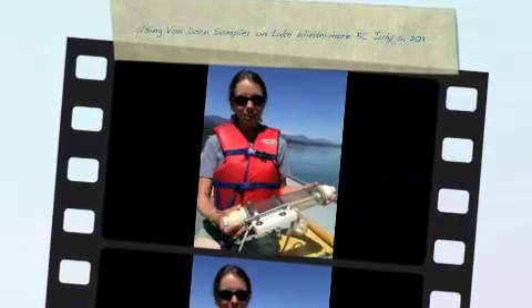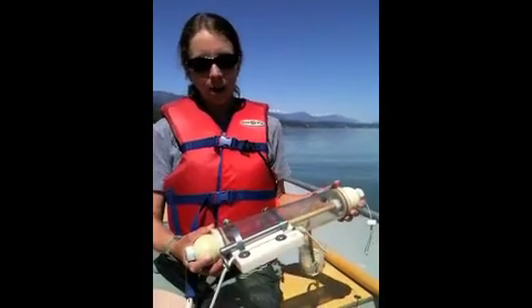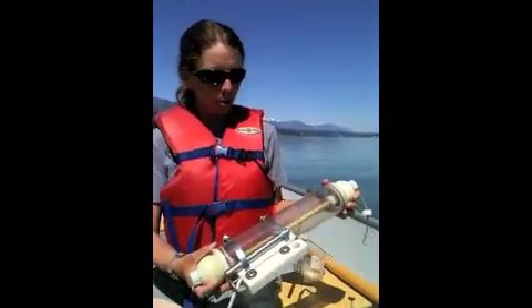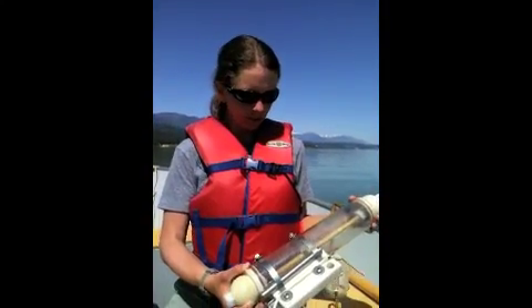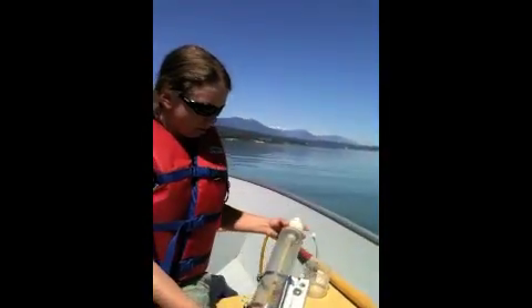This is a Van Dorn sampler. This is a device that allows us to take a sample of water below the depth of the surface. Right now we're at about three meters, so if we want to know what the water quality is at two meters below the surface, we send this guy down. I'll show you right now how this works — it's very clever.